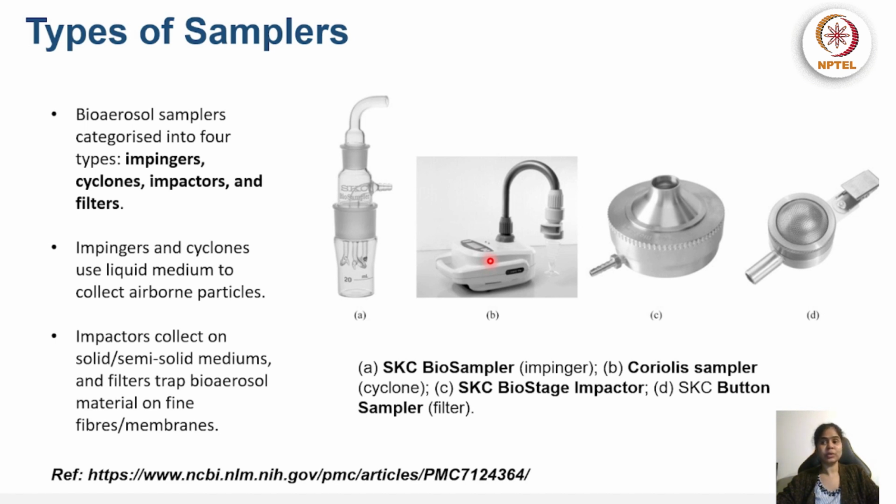For example, if I'm looking for bacteria, I can go with tryptic soy agar, or nutrient agar, or similar agar. It depends on which microbes I specifically want to target. Based on that, I can choose my medium. Similarly, if I want to go for fungi, I can choose potato dextrose agar, or similar agars. It totally depends on my objective. So I can put the plate here and turn it on. It's going to collect the air, and all the spores and microbes will settle down on the medium inside, which I can incubate later and do further analysis.